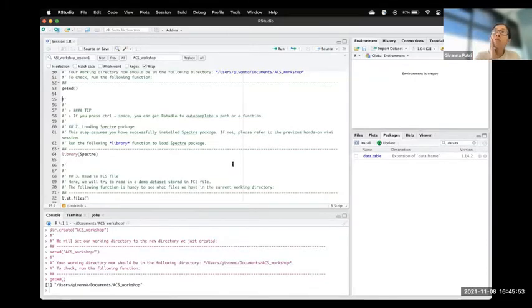I hope that's simple enough for everyone. Don't worry about all of this. Just pay attention, and we'll give you some time to try all this code yourself later on.